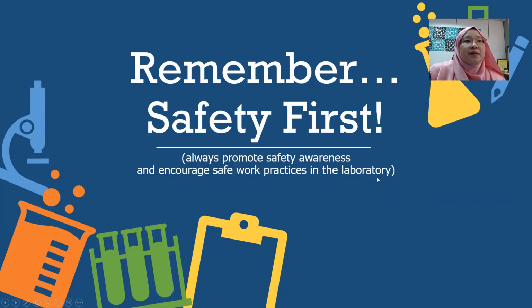And lastly, remember, safety is always first. Wherever you are in the lab, always promote safety awareness and encourage safe work practices. That means if you see one of your friends not practicing safety, you need to remind them that safety always comes first. Ask them to wear gloves, ask them to wear shoes, ask them to wear the lab coat.